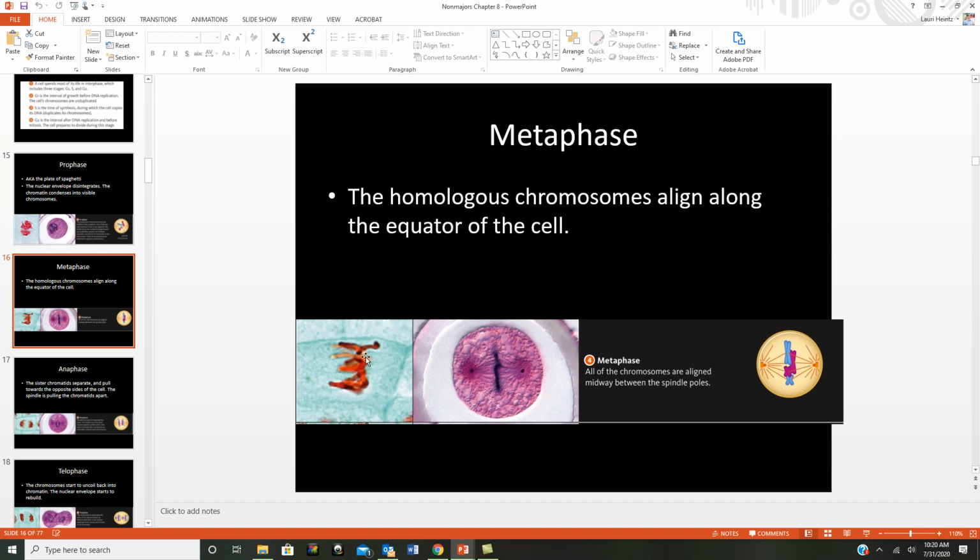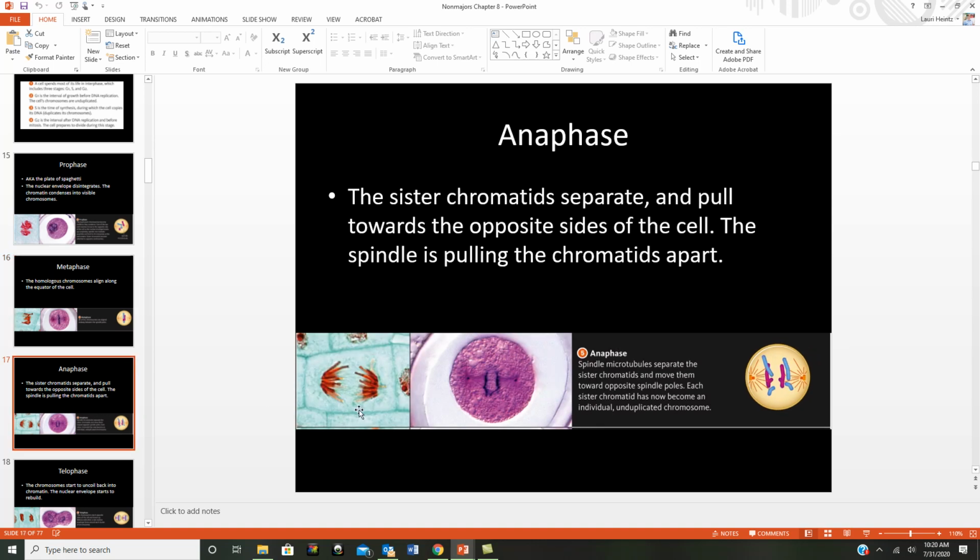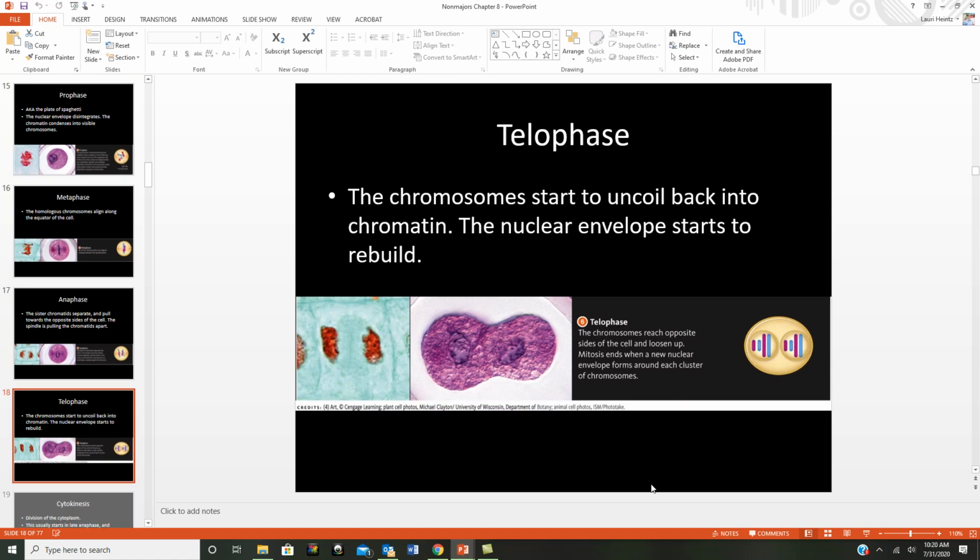This one also just shows you how much longer those plant cell chromosomes are than the animal cell chromosomes in the middle there. Anaphase, this one's a later anaphase. The animal cell up over here is kind of an earlier one where they're just starting to separate, but remember anaphase, that's when we pull them apart.